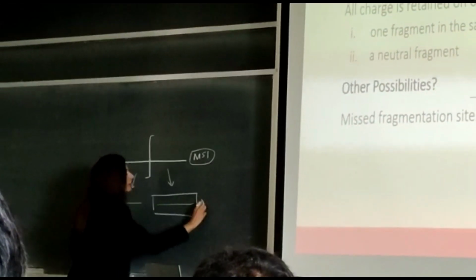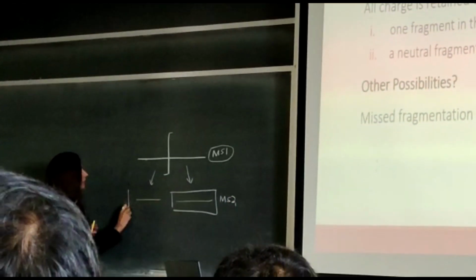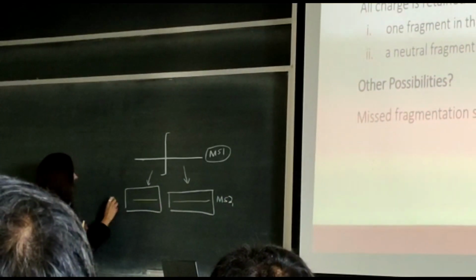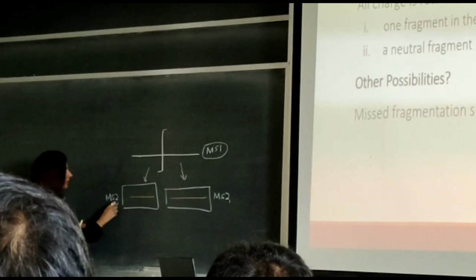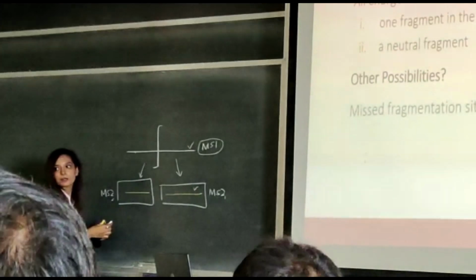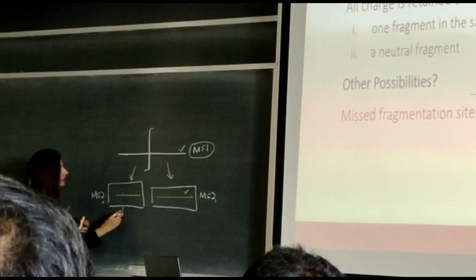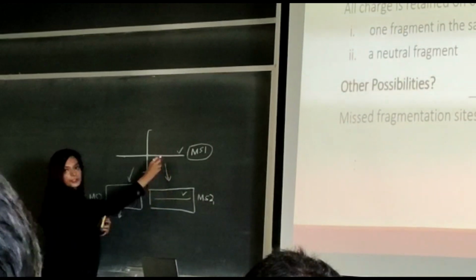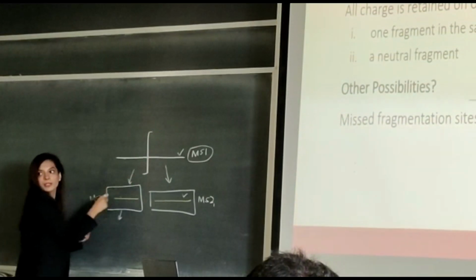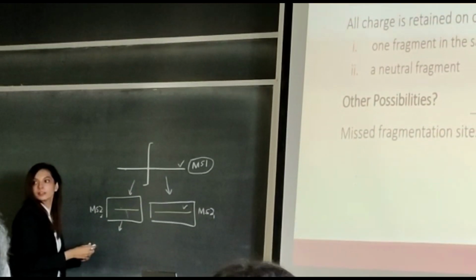Let's call it MS2-1, and let's call it MS2-2. So we have this ion reported, and this was missing. To calculate this, we subtract this information from this, and we get this. So basically, you have MS1 and MS2. Yes, one of the MS2 is reported. Thank you very much.